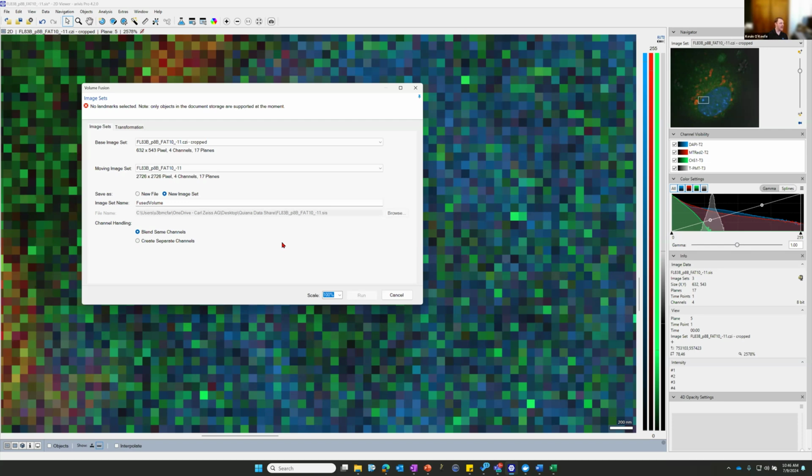So let's say you have an assay or long-term imaging session that you're running, and you are doing a 24-hour imaging session, or at least you have your sample set up, image it at hour 1, wait 2 hours, image it again, etc. And you have a bunch of different images of the same ROI that you want to now combine. You can do this volume fusion.